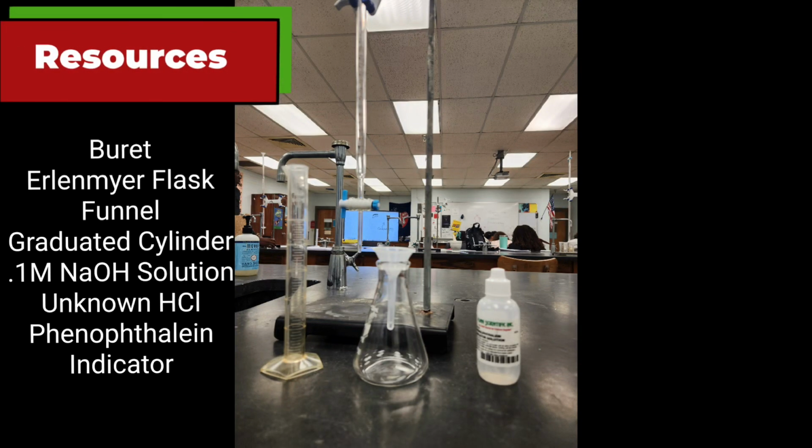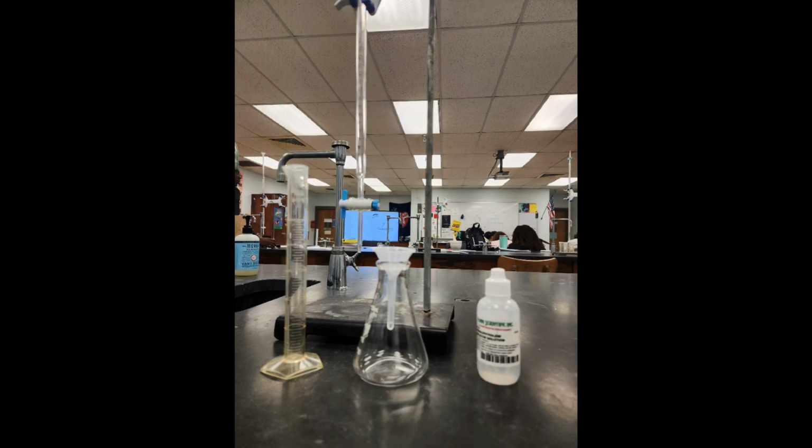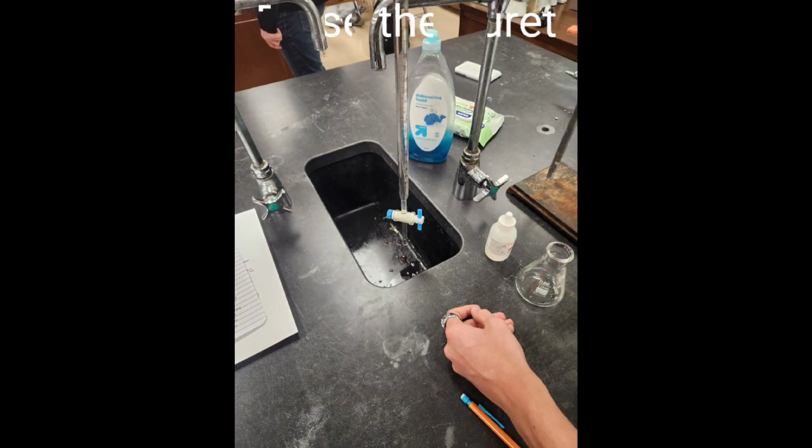So here's the beginning of our titration lab. Our objective is to determine the unknown concentration of a hydrochloric acid solution. So for this we will be using a burette funnel, an Erlenmeyer flask, a graduated cylinder, and an indicator solution. Our first step is going to be to rinse out the burette with water.